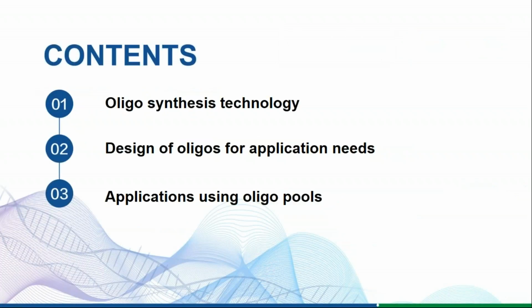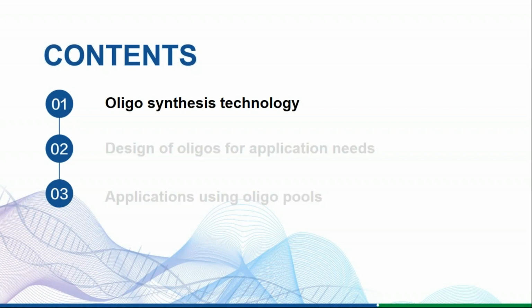So today we're going to be talking about oligosynthesis technology, the design of oligos for applications, and those applications themselves. Now, as a caveat, I personally am largely interested in the synthesis technology. That's what my expertise is in. That being said, I have been exposed to a lot of these applications, and I'll be happy to share anything that I picked up along the way. If there are any questions at the end that I can't answer specifically about these applications, I'm sure we can find someone at GenScript who can. Just feel free to contact me or Kim, and we'll get back to you as soon as possible.